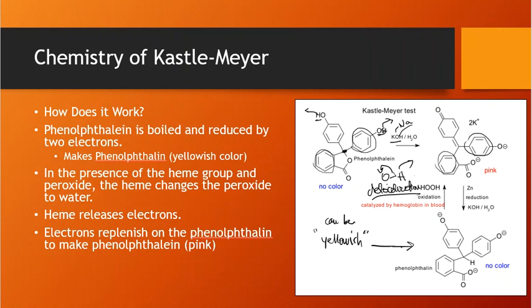So a normal titration, this is how it works, right? You have an acidic solution, you add some phenolphthalein, and it's colorless. It starts off like this. As you add base, the acid is neutralizing that base. As you add more base, sooner or later, the base will overtake the amount of acid, and we get basic conditions. And this is representative of the KOH or the NaOH. This is a base. And that goes pink. This is why that molecule turns pink. It's a rearrangement. It's a conjugation of the phenolphthalein. And that's why we get that color change.